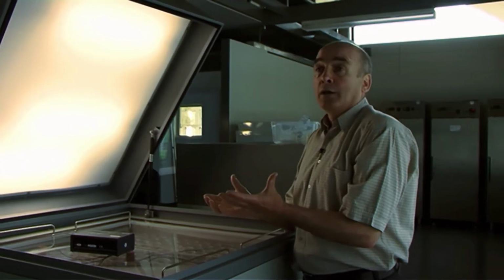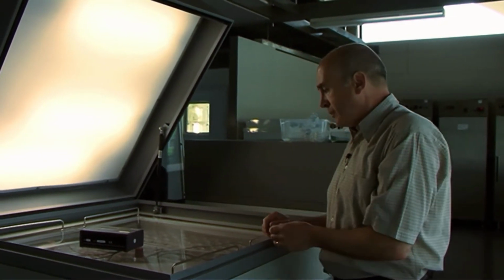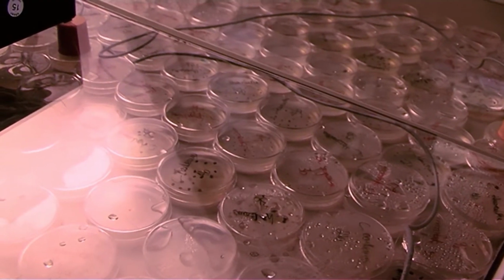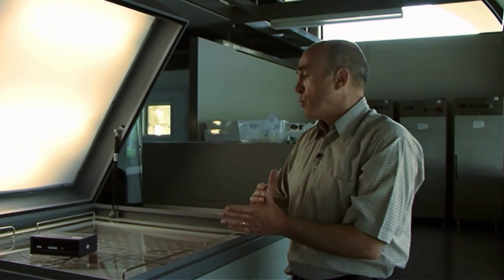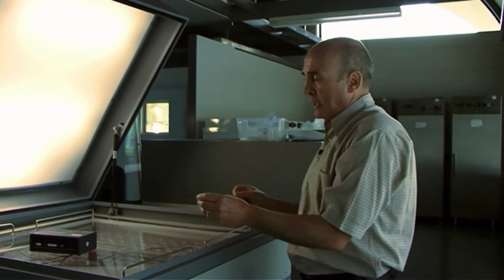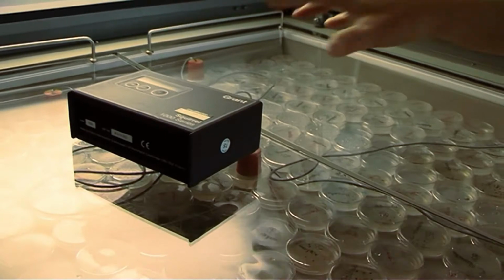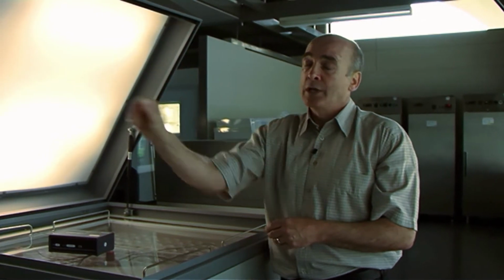And what it means is that every single position marked by these petri dishes in this experiment experiences a unique diurnal temperature environment. And you can see by the number of dishes that we have in this particular experiment, it gives us an opportunity in one shot to look at a very wide range of temperature combinations. And we would use this equipment as a kind of range-finding device to identify temperatures which appear to be suitable for germination.